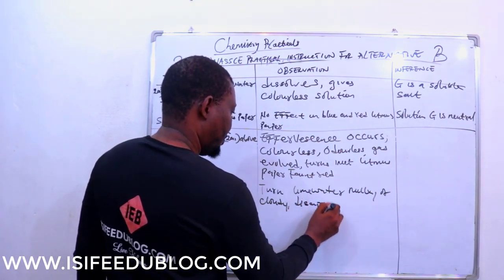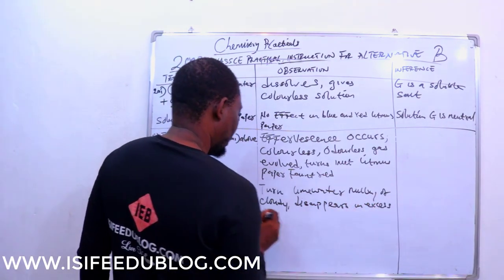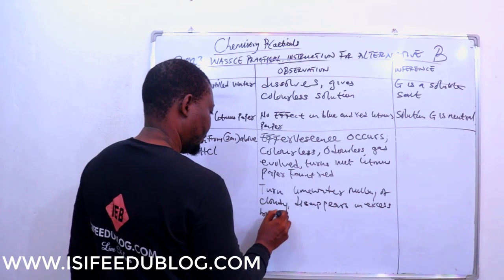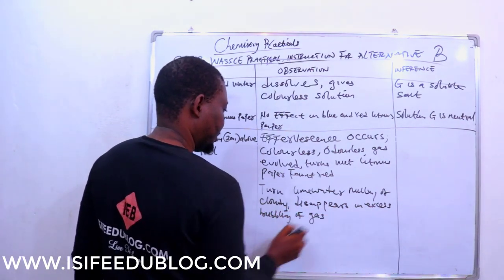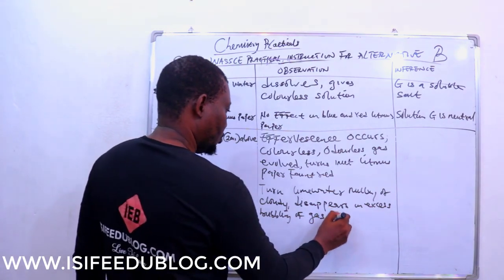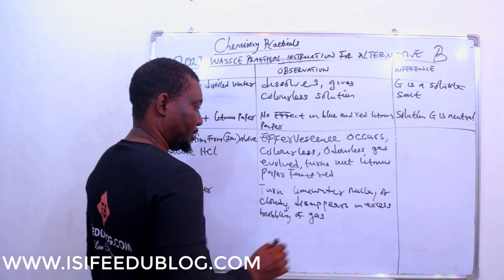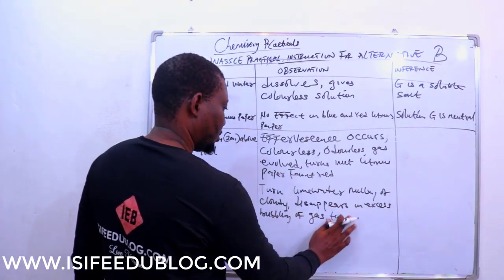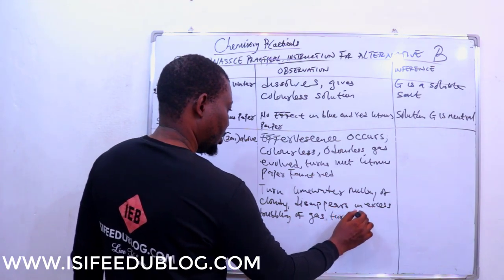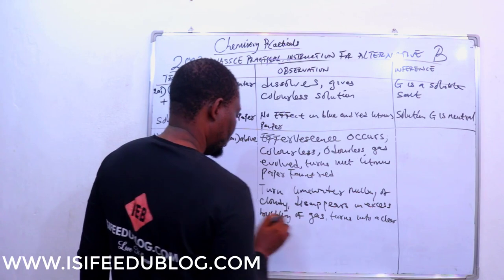This milkiness disappears on excess bubbling of gas and turns into a clear solution.